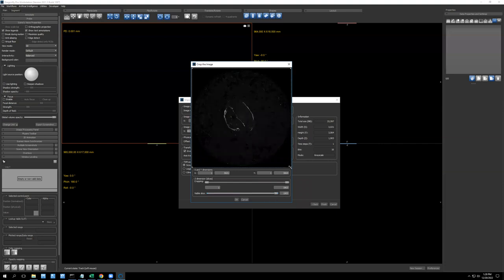You're going to pull in this box and crop as much as you can without cutting off parts. So you would go through the slices looking at the left side, the right, the top, and the bottom. For example, in the bottom, we need to extend that to there.